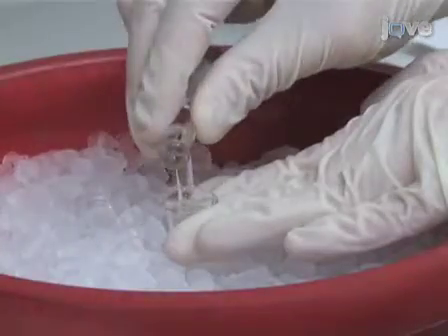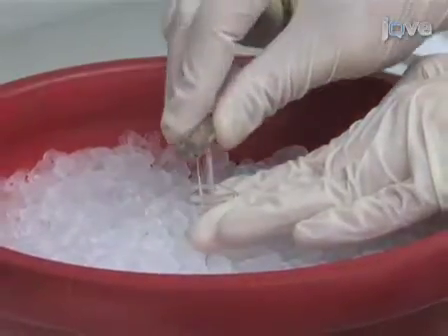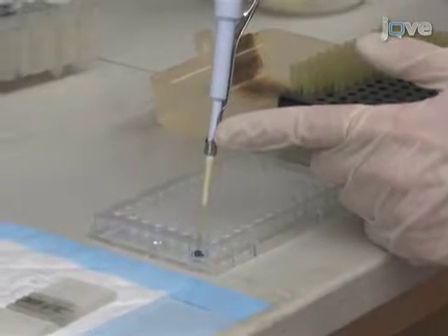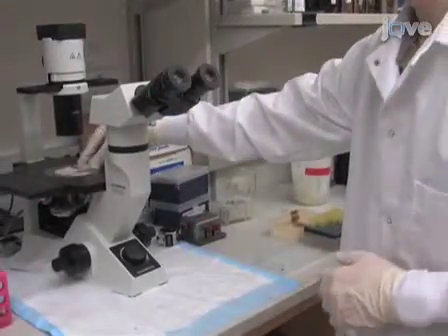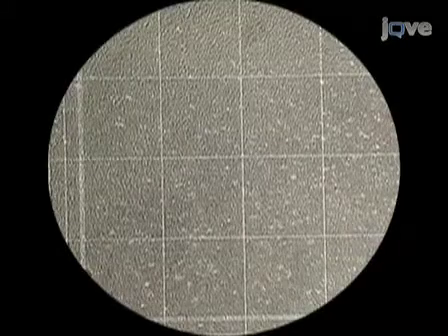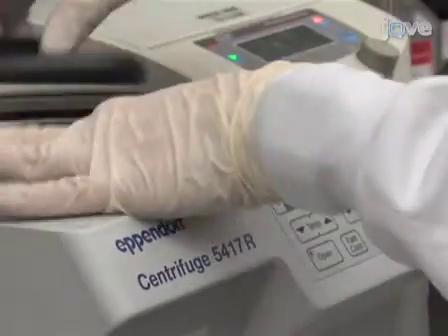Following the incubation on ice, we dounce the cells with a homogenizer. This might take about 40 to 50 strokes. We can check for the completeness of homogenization by staining an aliquot of the dounced cells with trypan blue and looking through a light microscope. This is the first shot after 50 strokes with a dounce, and this is the second shot after 80 strokes with a dounce.